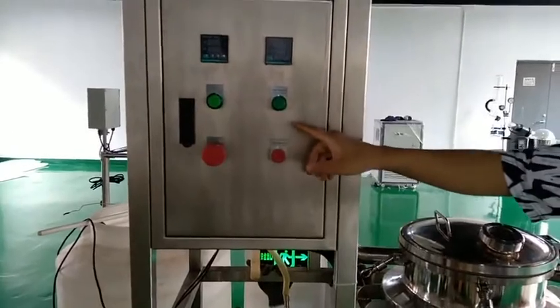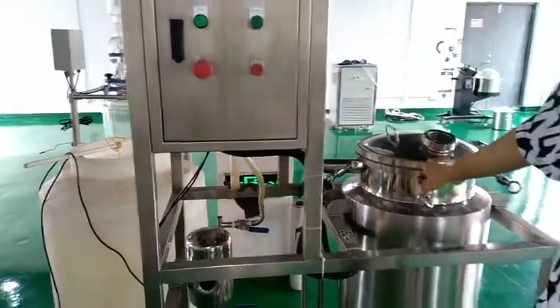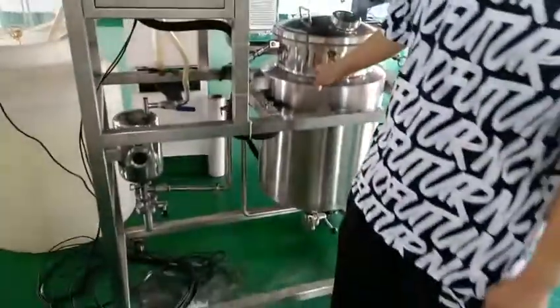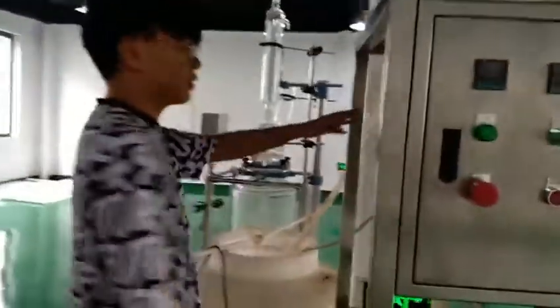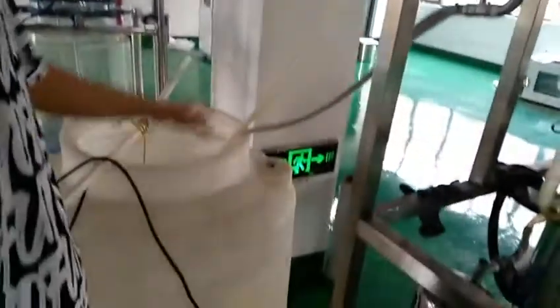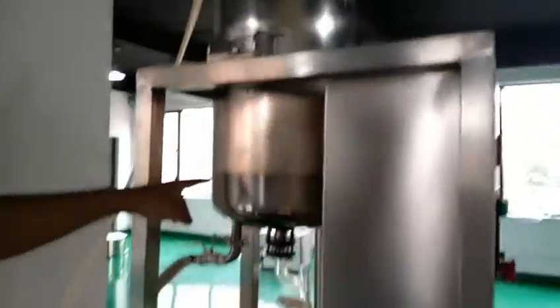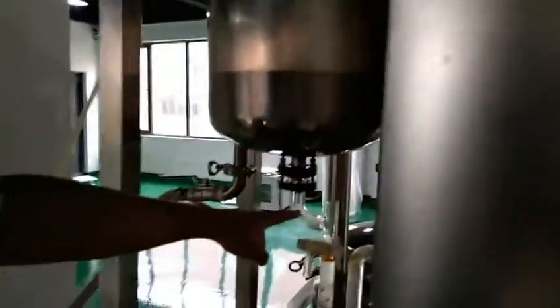Then open the switch. The machine will produce the extraction oil. You can see this part is the condenser. You can use alcohol or cold water to cool this condenser. Then the extraction oil will be produced from this.